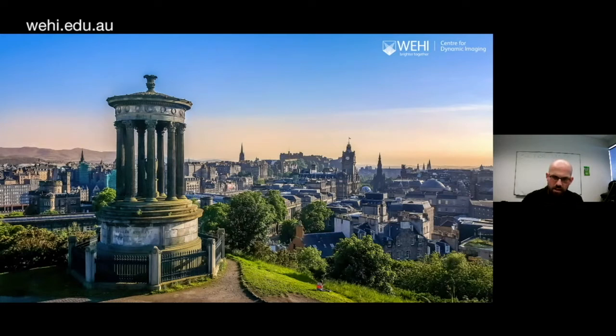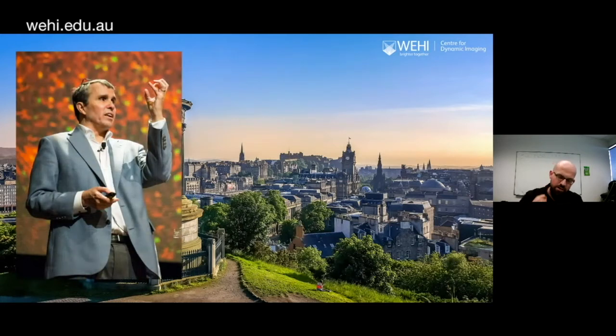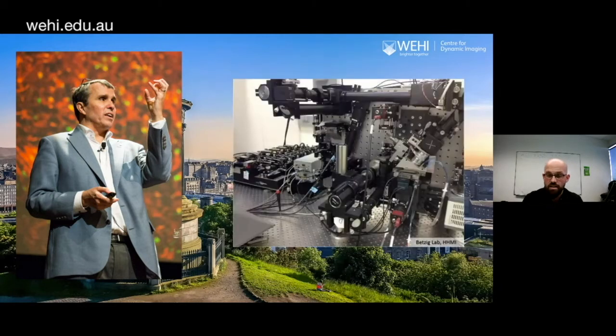And this American guy got up and gave a talk, and he was called Eric Betzig. Now, some of you might be familiar with this guy. He came to WEHI in 2015 to give a talk, and he spoke about this revolutionary new technology in the live cell imaging world, and he called it the lattice light sheet.